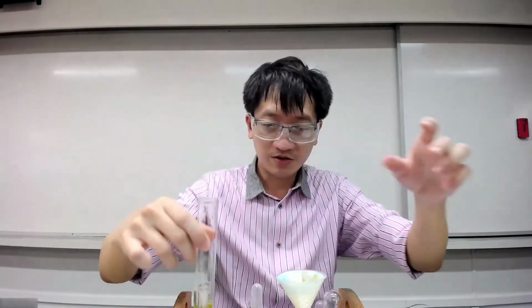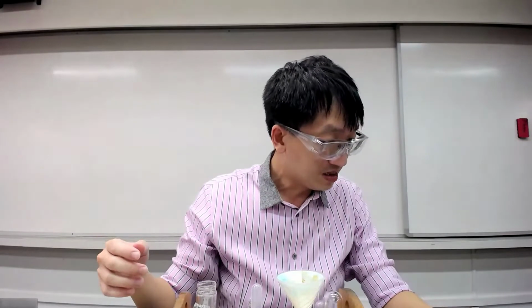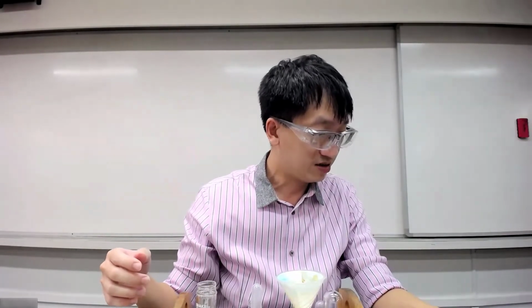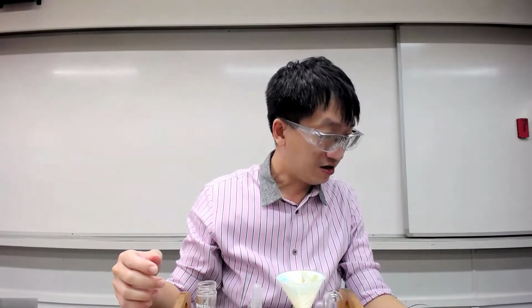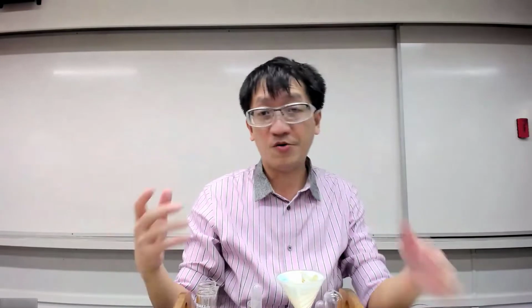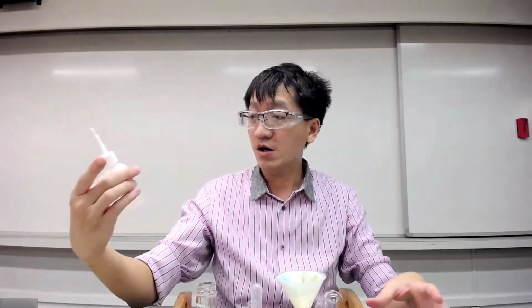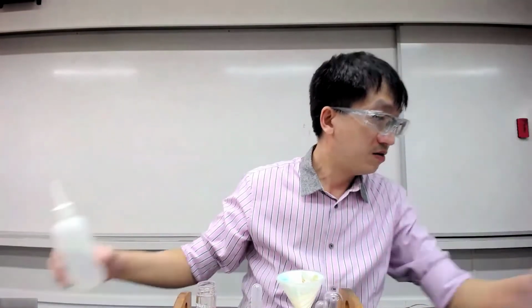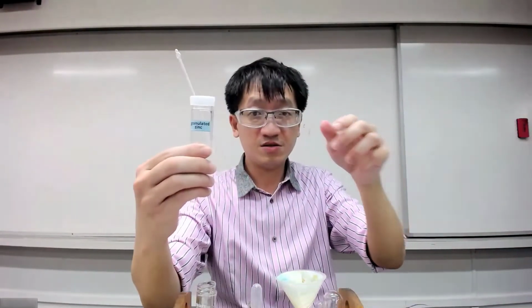I'm just going to shift it to the side because we are required to do some heating. We're supposed to put in some zinc granules, and then gently heat the mixture. After that, it's probably expecting some gases from there, then we're going to test for it. I'm just going to put things which I don't need at the side. Get ready some zinc granules over here.